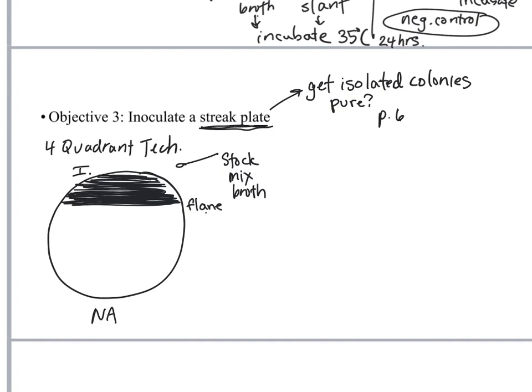After quadrant one, you're going to flame your loop. Because after quadrant one, the goal is to spread that growth out a little bit. And remember, you're just streaking on the surface of the agar. Sometimes your loop will poke down in the agar a little bit and don't worry too much about that, but you really want that growth just on top of the agar. So I've flamed my loop. And you're going to have to let that cool a little bit after you flame it because that's going to be super hot. Cool it for about 15 seconds. And then you want to just, again, streaking on the surface of the agar, grab a couple of streaks from that previous quadrant and then spread it out without touching into that previous quadrant.